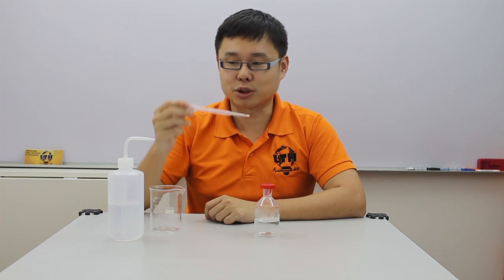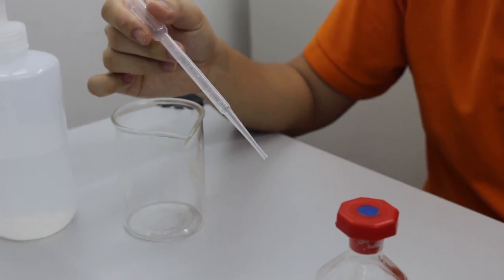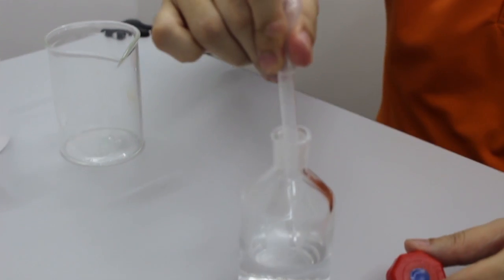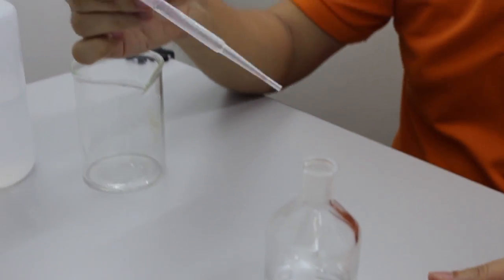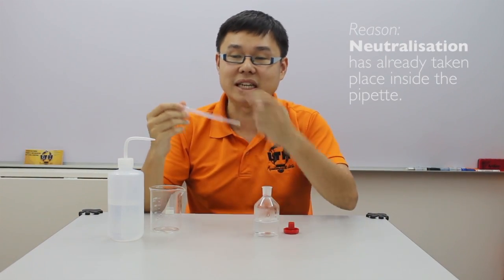If the student forgot to clean the pipette thoroughly and then used the same pipette to extract hydrochloric acid to be added into the carbonate for the reaction, they may fail to realize that neutralization has already happened inside the pipette.